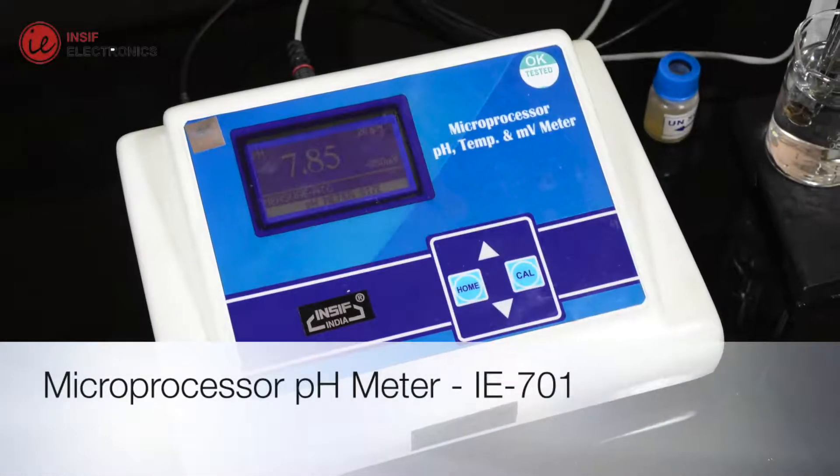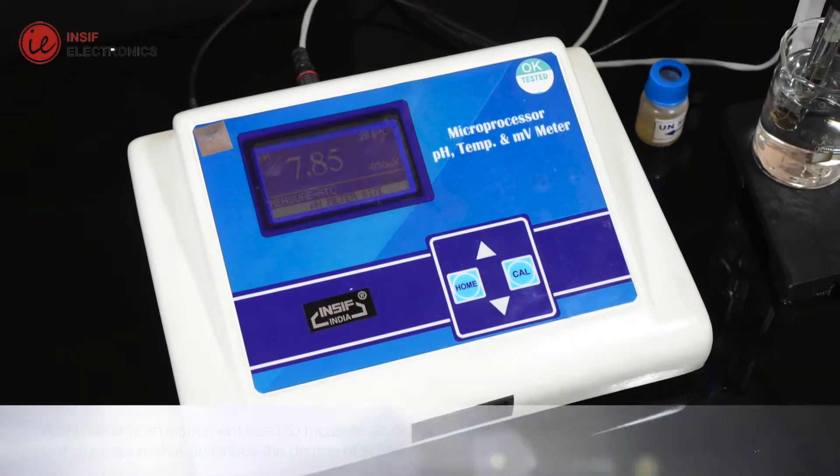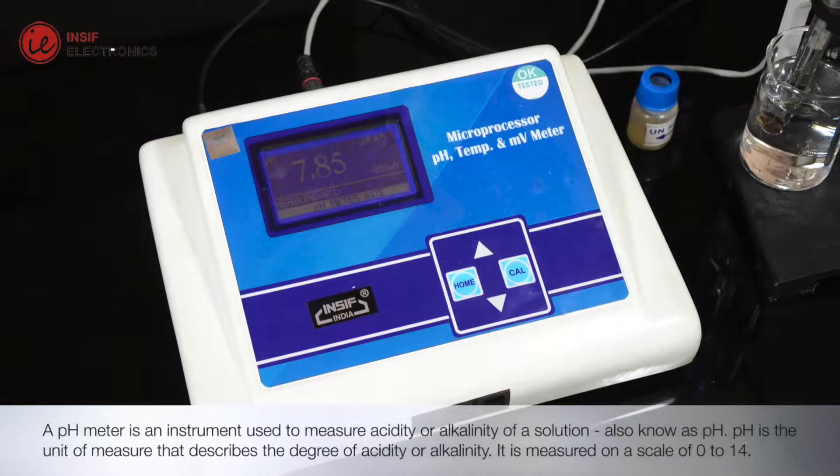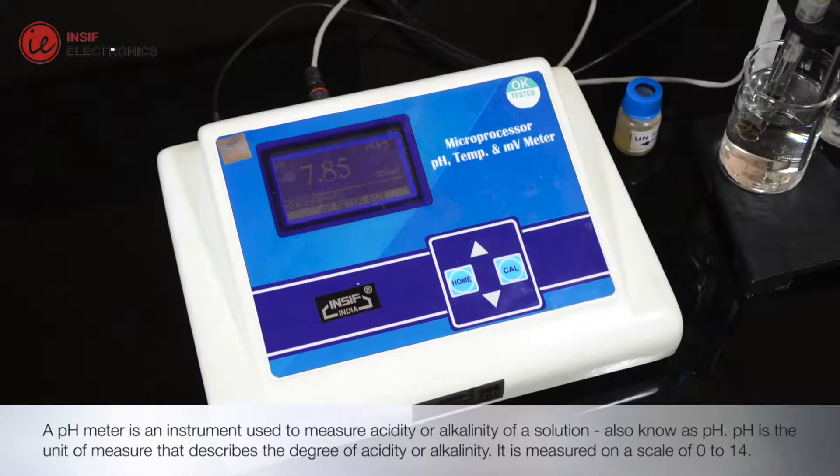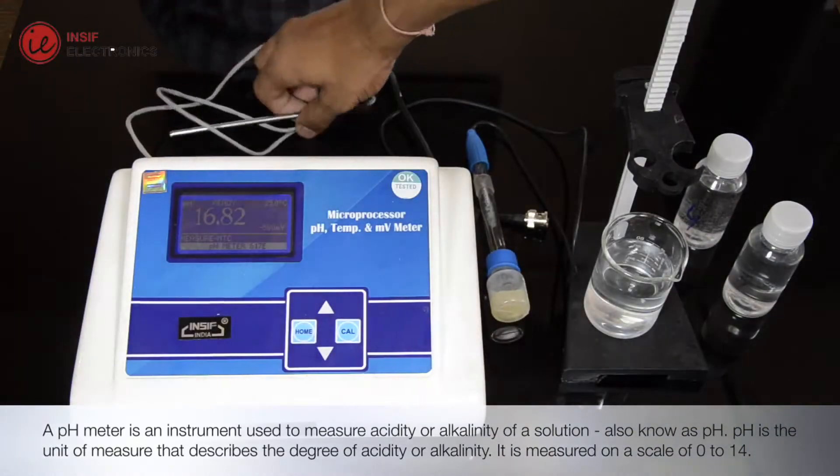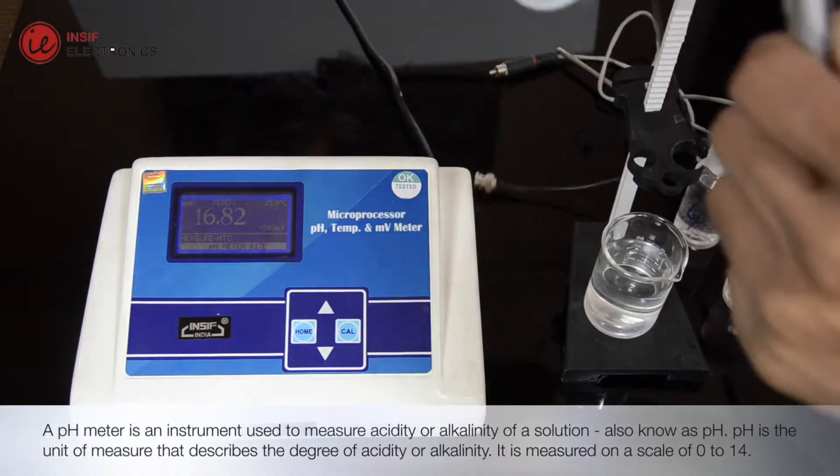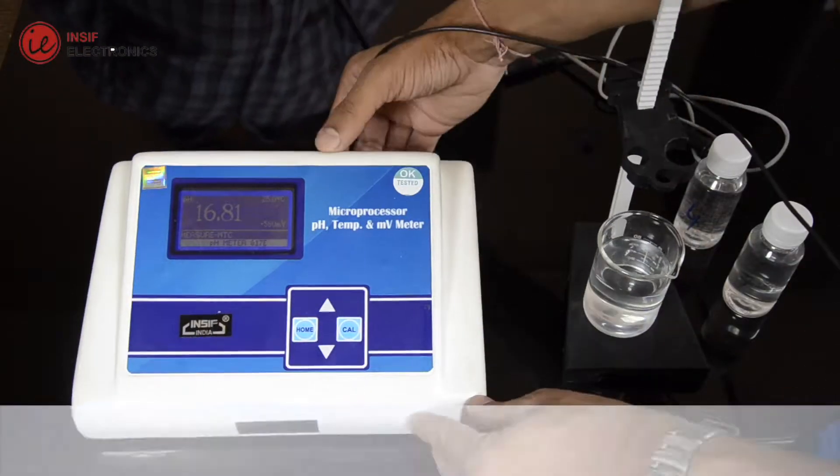A pH meter is an instrument used to measure acidity or alkalinity of a solution, also known as pH. pH is the unit of measure that describes the degree of acidity or alkalinity. It is measured on a scale of 0 to 14.